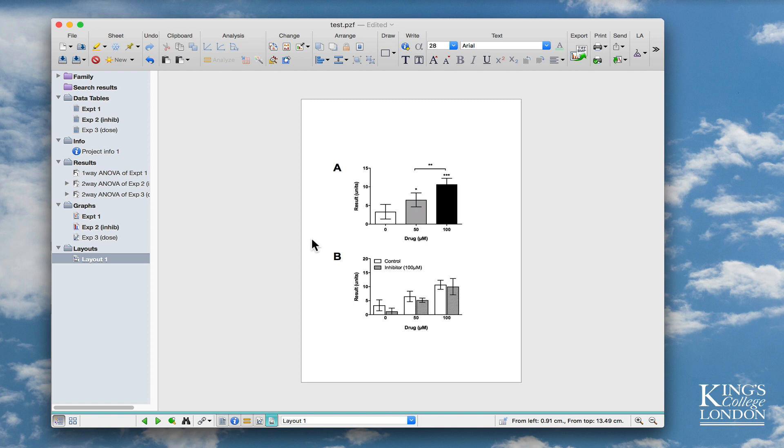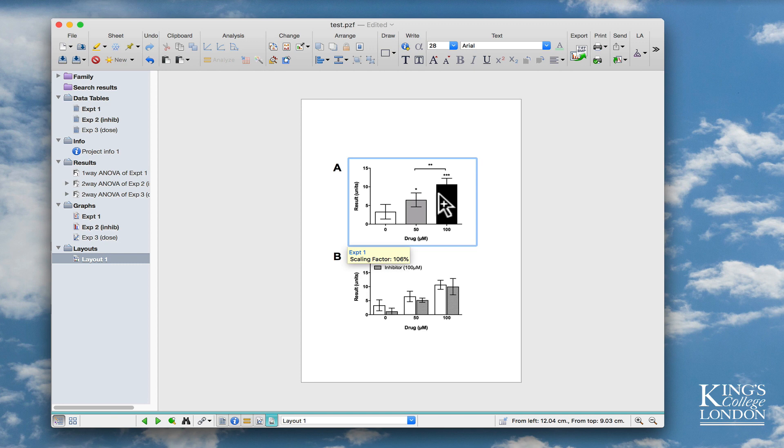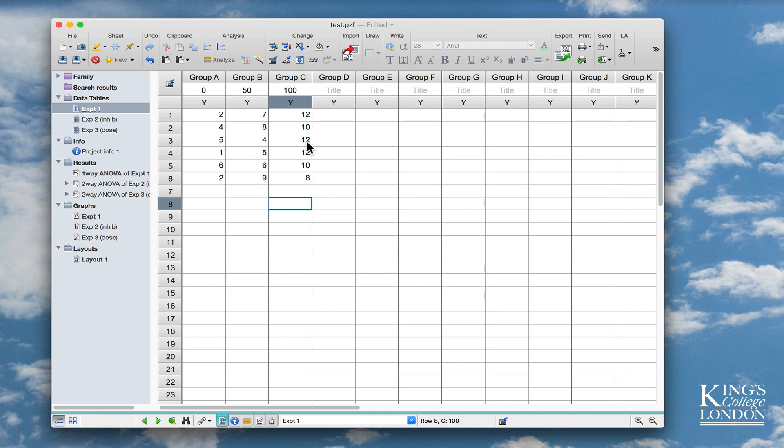If I wanted to find the data set, for instance, for experiment A, I would have to click on the layout, work out that this was experiment A by holding my mouse over it, and then go to the top here and click on experiment A data, and now I can access the data for experiment A. This is okay when you've only got a couple of graphs on your page, or you've only got a Prism file with maybe, as in this case, one or two extra graphs.